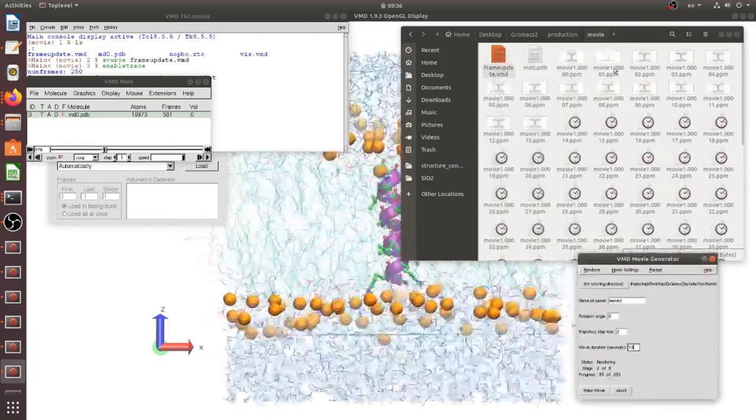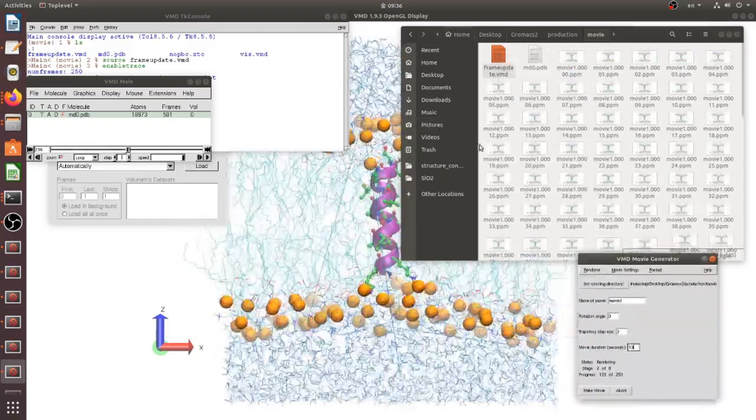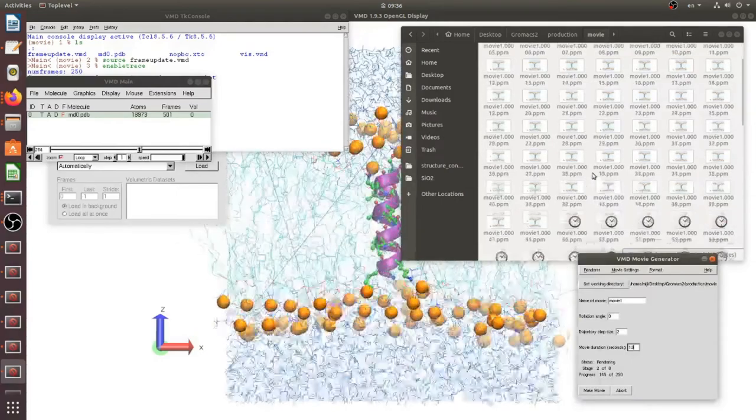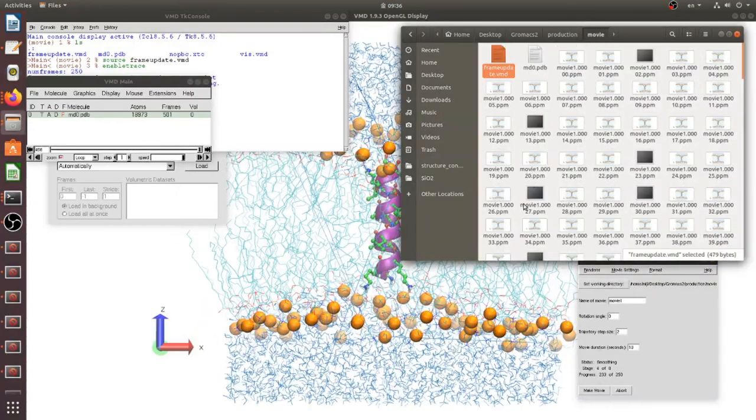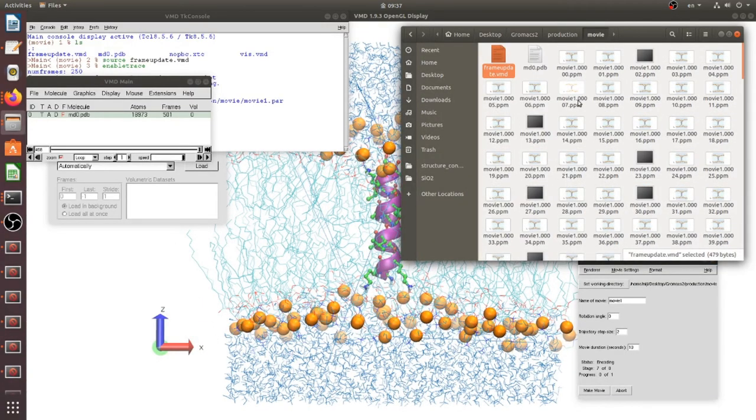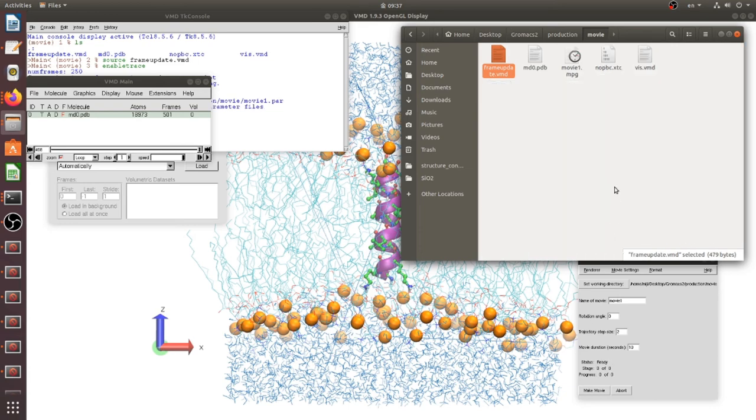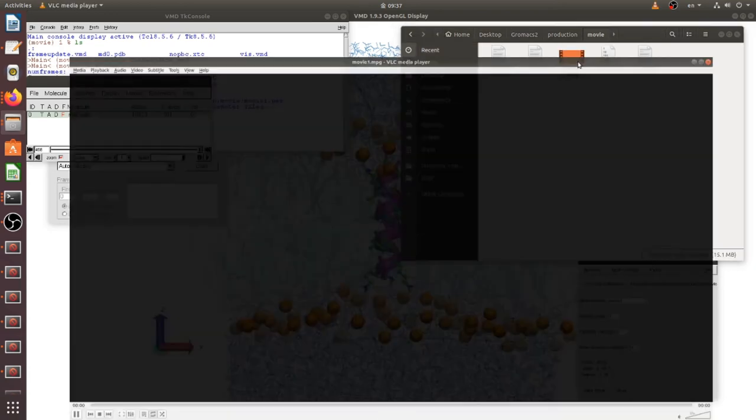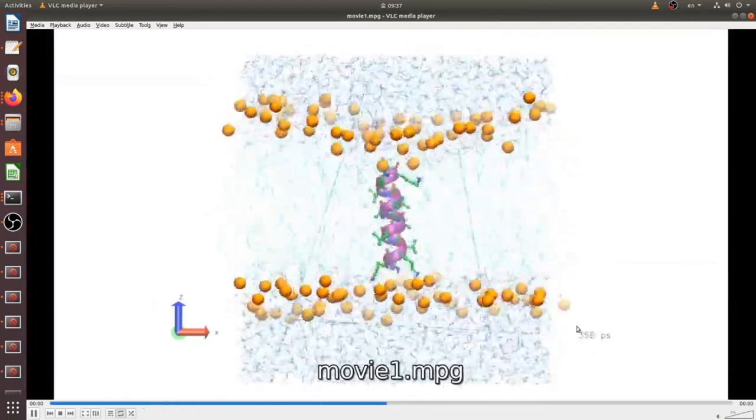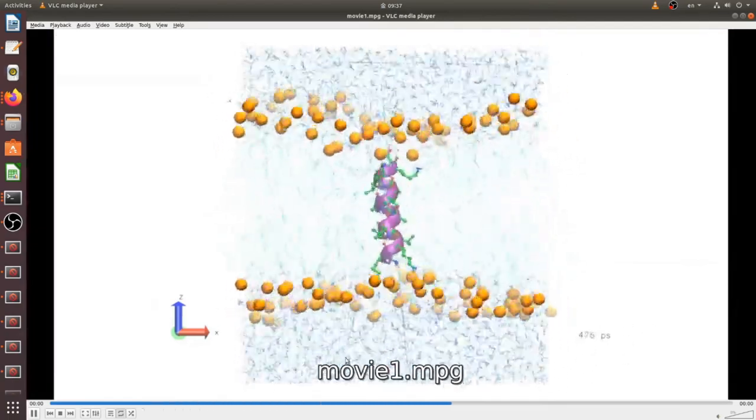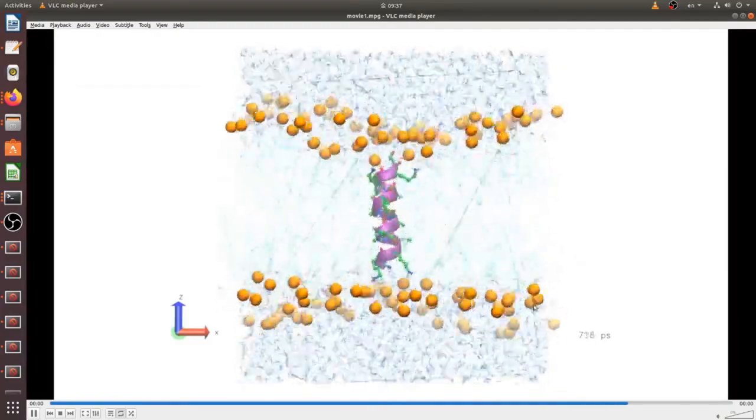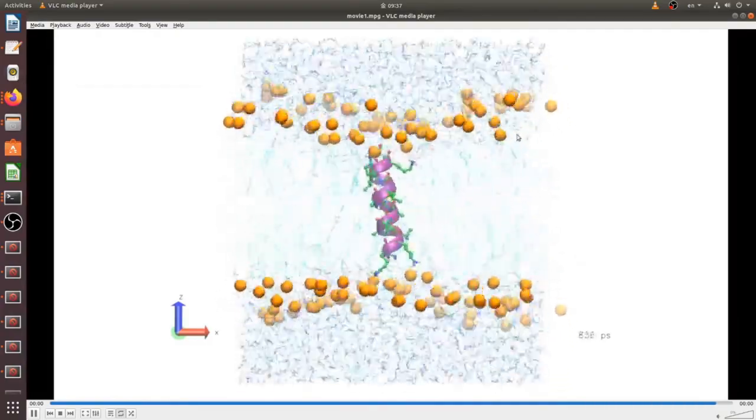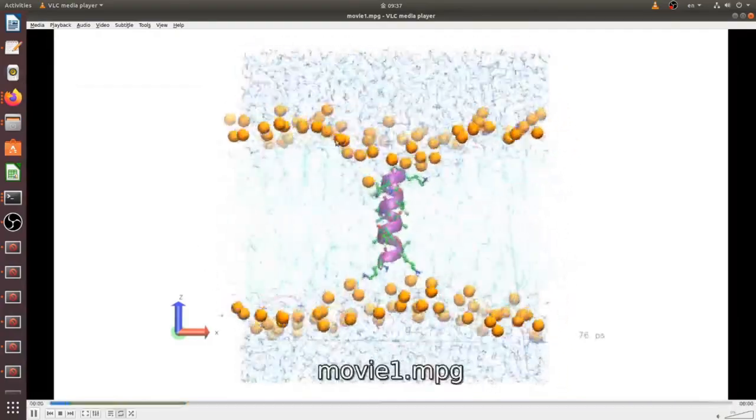There are many snapshots shown in this folder. After VMD makes video it will remove all these figures. Yes, our movie was finished and you can check there is time step and snapshots are changing.